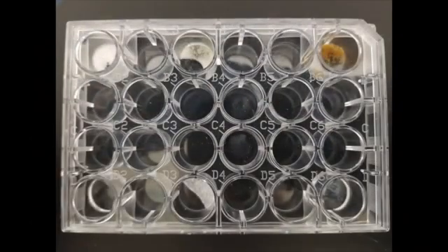Here are some stills of the individual cells, just in case it took a little while for some of the precipitates to show up.